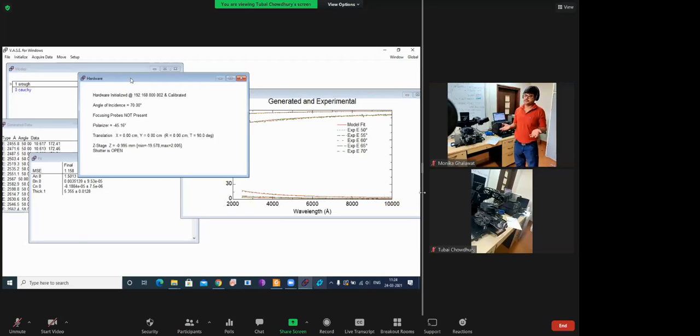Whatever physics there was, I already explained yesterday, and the leftover physics I'll tell you this afternoon and tomorrow. But these are just empirical equations. Does it answer your question? Yes, sir. These parameters have no physical significance. The only meaningfulness is the industry application for calibration purposes. You can just find some interpolation.